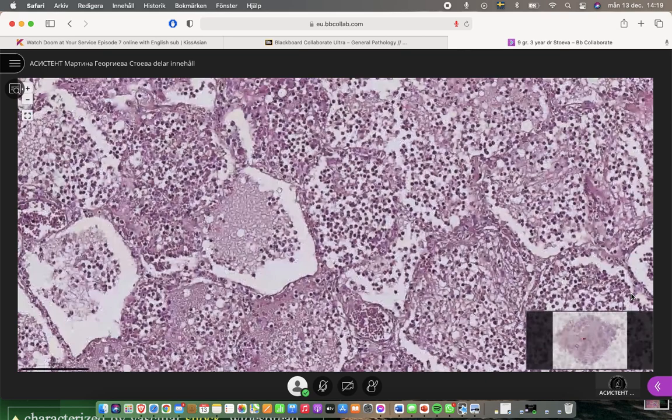They are formed during the routine processing of tissues when the fibrinous exudate shrinks, leading to detachment of the exudate from the alveolar wall.